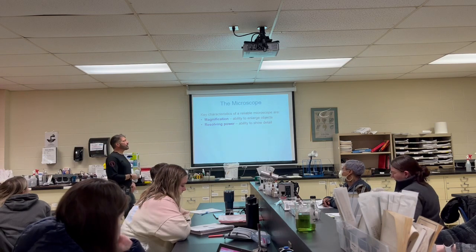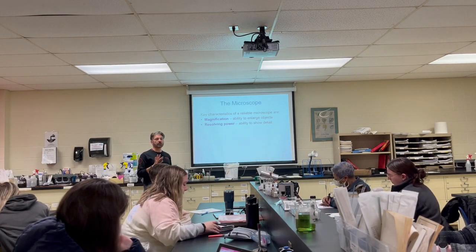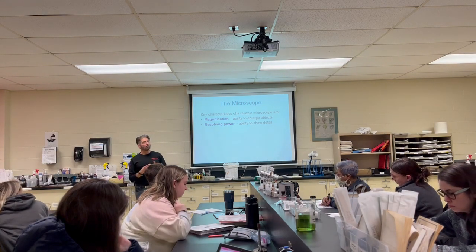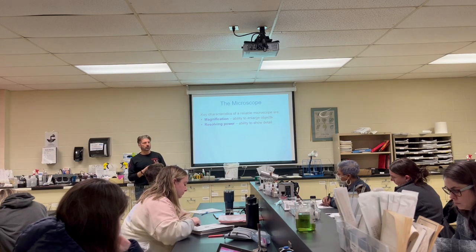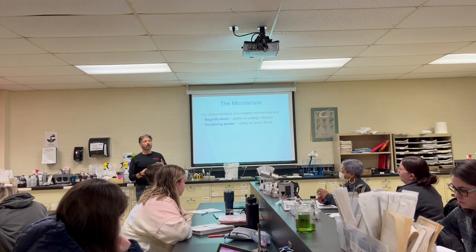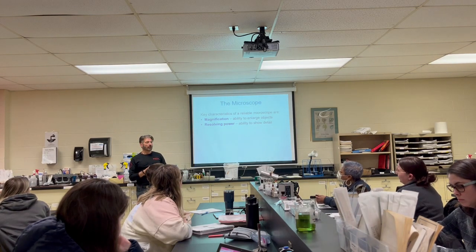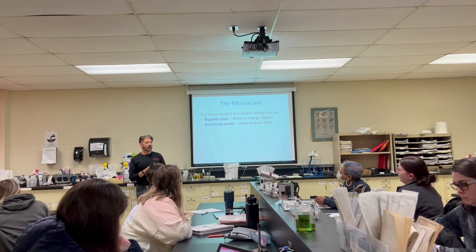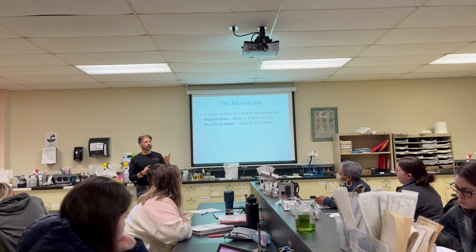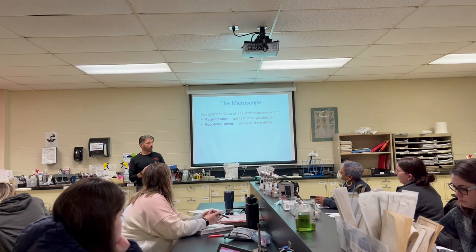All right, so magnification is the ability to enlarge objects. Anyone who's taken anatomy before, what's the most magnification we get on a microscope? Or how would you figure out what total magnification you have? Multiply the eyepiece ocular times the objective. All the eyepieces here are 10x. The largest magnification we have here is oil immersion, which is 100.